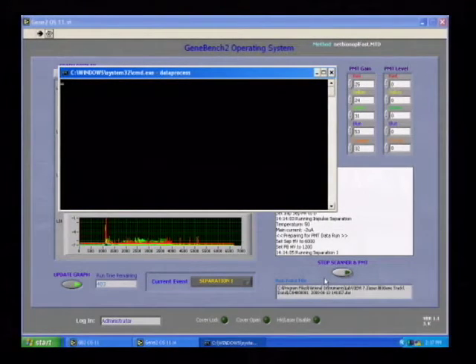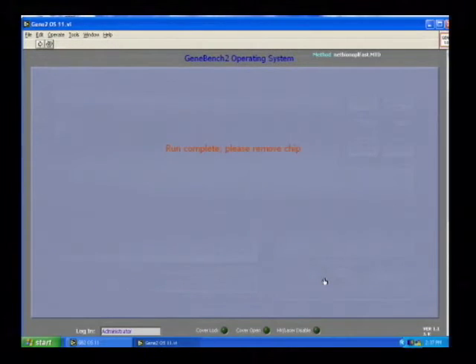The computer shuts down the high voltage and starts to process the data. It collects all accumulated data and writes it into a data file that can then be used for processing and allele calling. This concludes the run.